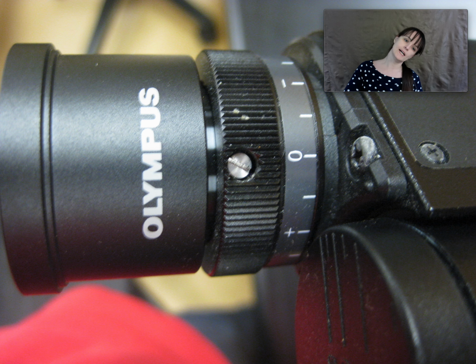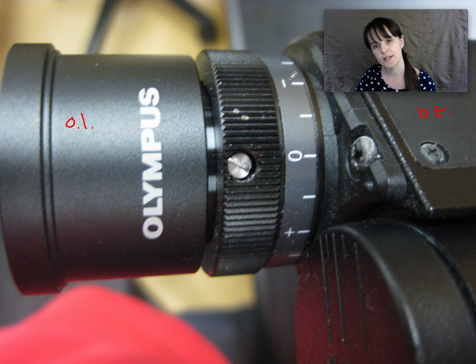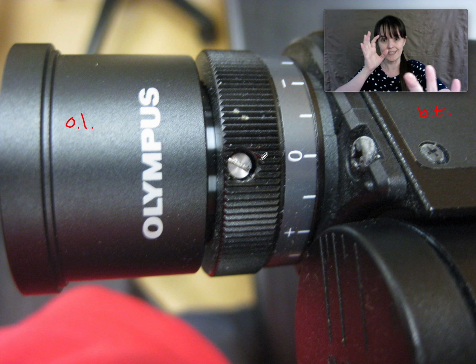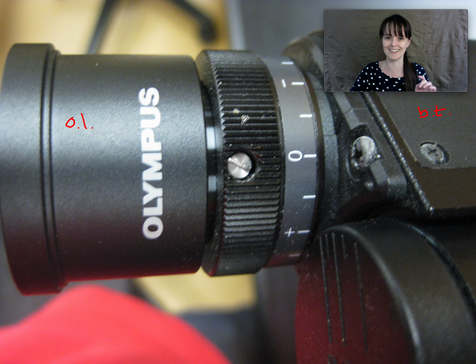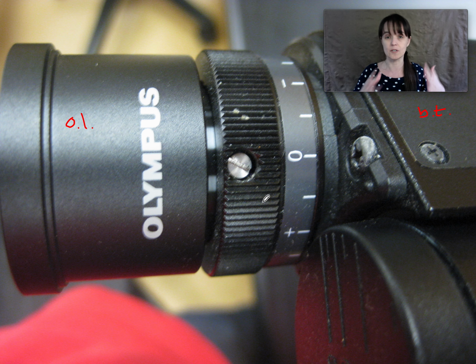Oh, hello. Okay, so this is the ocular lens, and this is the body tube. On this left ocular lens, you can actually adjust the focus. When you get on a new microscope, you want to focus in the right ocular lens, and then this left ocular lens, you can rotate it to bring it into focus for your left eye.